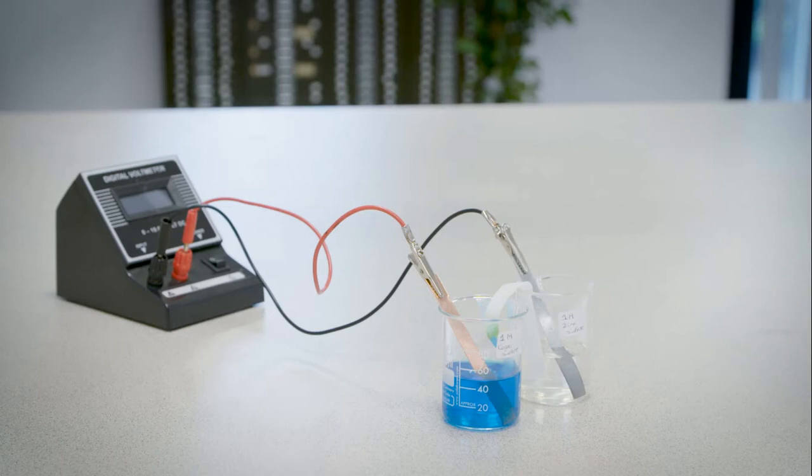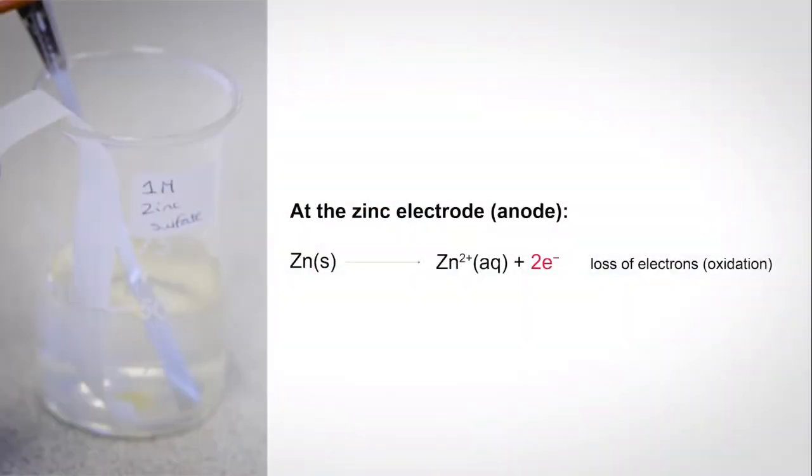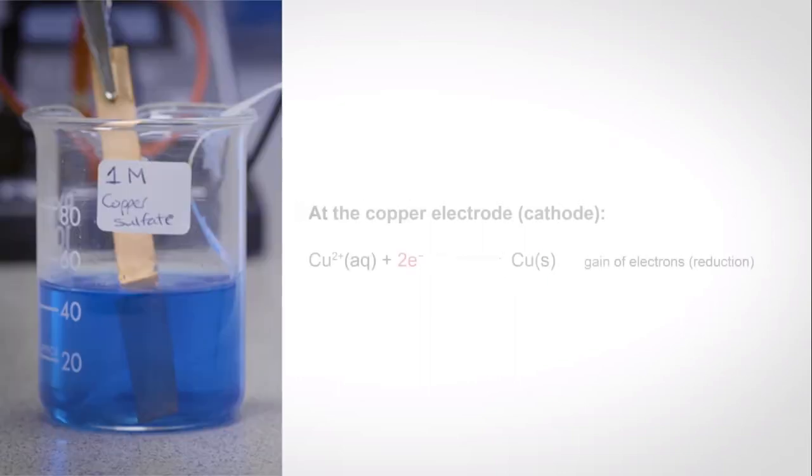An electrochemical cell involves a spontaneous chemical change brought about by redox reactions at each half cell. In the zinc-copper example, zinc is the more reactive of the two metals and is the anode. Zinc loses electrons, therefore oxidation occurs at the anode. At the copper cathode, reduction occurs. Copper ions accept electrons, which travel from the external circuit from the zinc half cell, combining to produce copper.